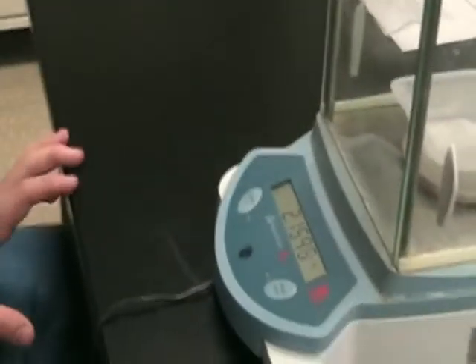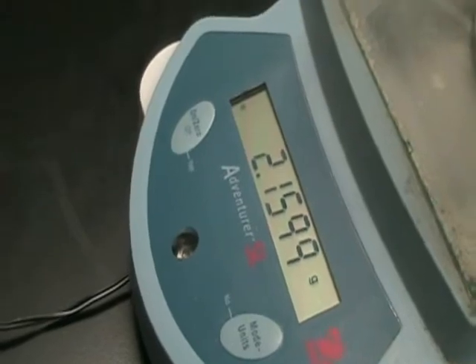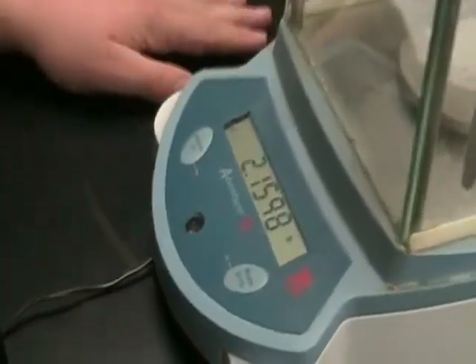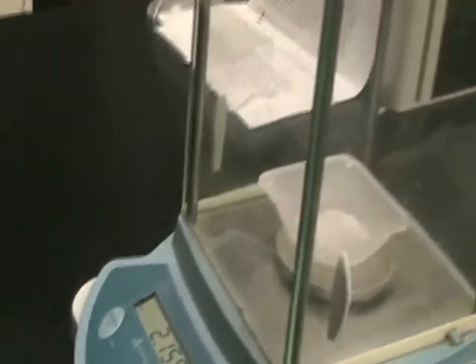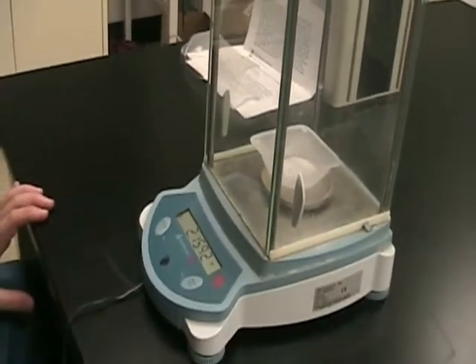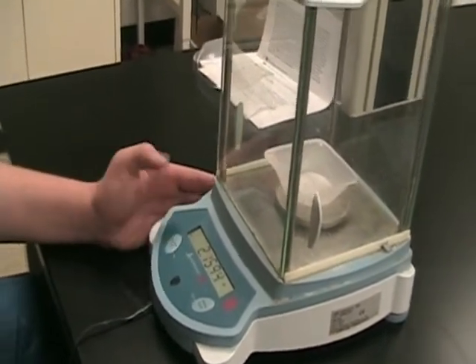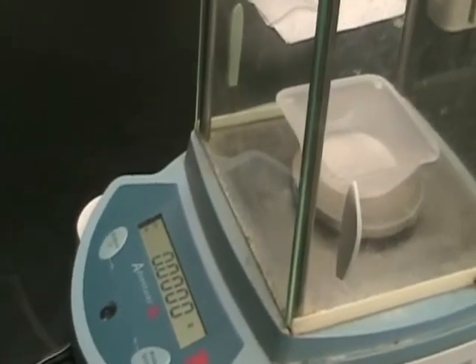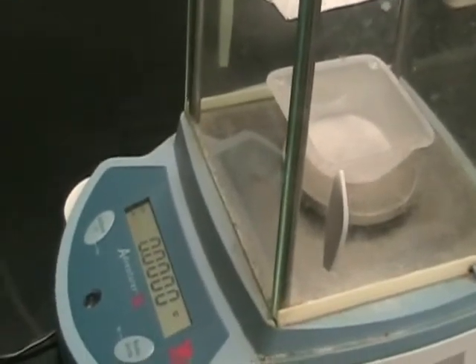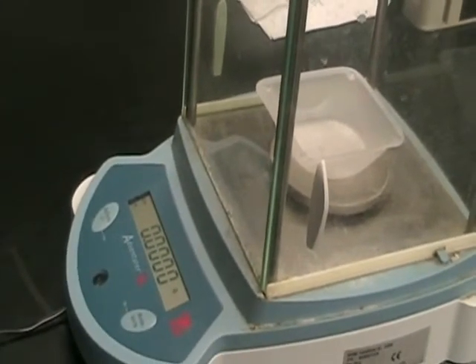As you can see, the weigh boat is taking up mass and causing a measurement — it weighs 2.15 grams. If you only want to weigh one gram of, say, copper sulfate, you don't want to get to 3.15 grams. So press the on button again — that's the zero function. It removes the weight of the weigh boat, so when you place your copper sulfate, it will only weigh the mass of the copper sulfate instead of adding both.